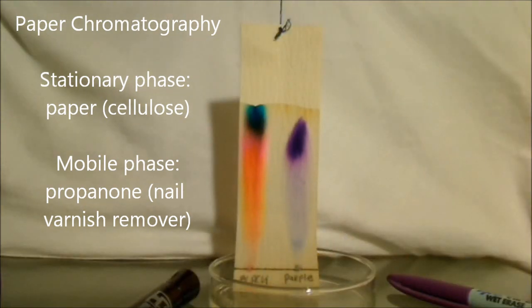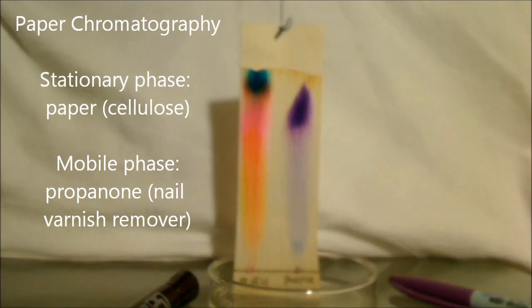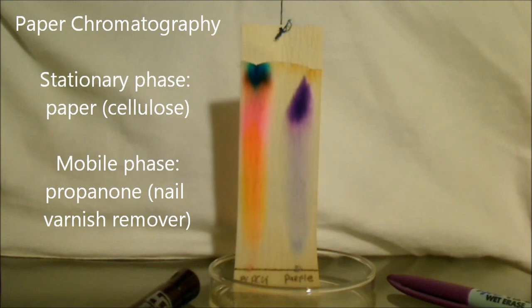So looking at the purple ink, that prefers to be dissolved in the mobile phase, so it's going up quite high. The orange component of the black ink, well that's not moving up very much at all compared to the others, so that one would rather be in the stationary phase.